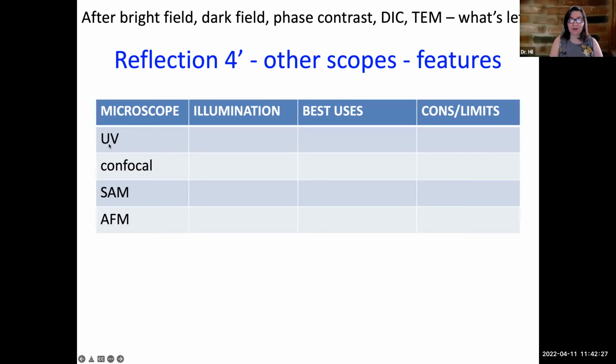Because UV, ultraviolet light, has a shorter wavelength, the resolution is better than a light microscope. The contrast is better. It allows us to see subcellular detail, allows us to actually co-localize things. And as was mentioned also, while you can look at live things, unlike the electron microscope, you can't look at them for too long because UV is damaging. Okay, let's move on to the confocal.